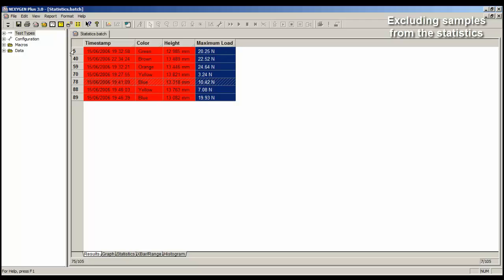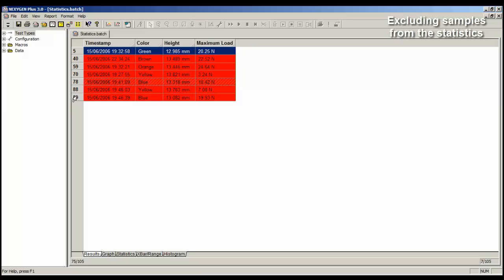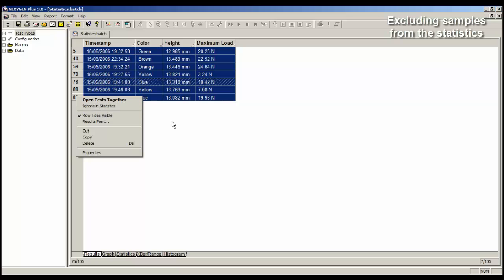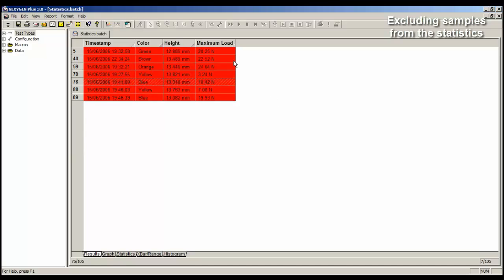We can either exclude all of them by just clicking on the first one, holding the shift key down, and right mouse click on the bottom one, and we can see another menu, and there's an option there to ignore in statistics. And if I do that, they will all be ignored. Now I don't want to do that, because looking here, I think these are OK.